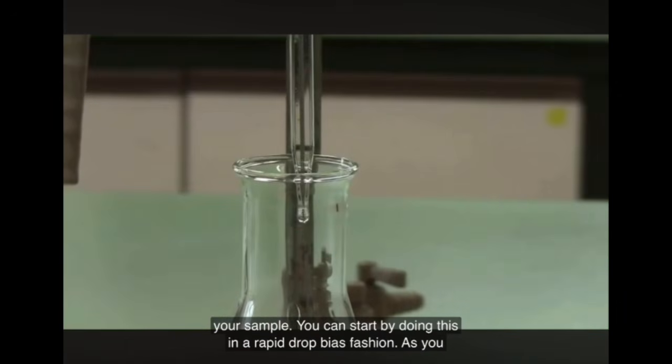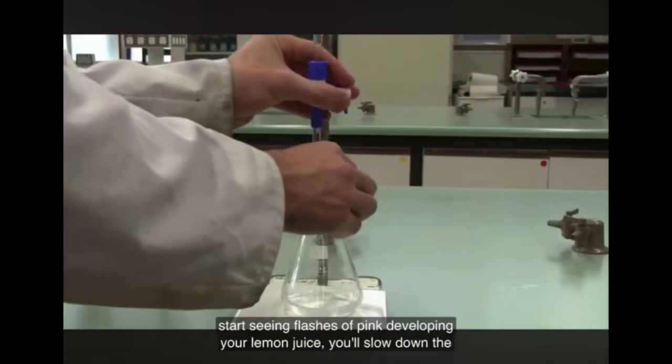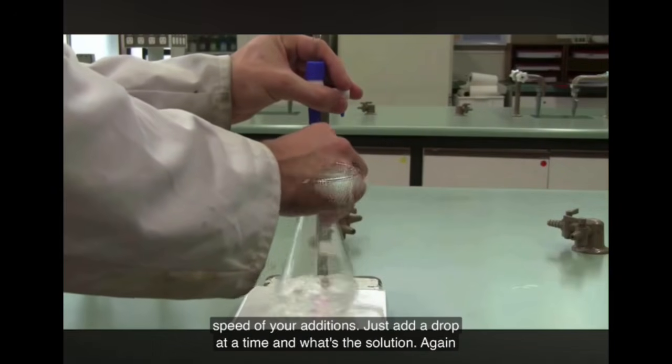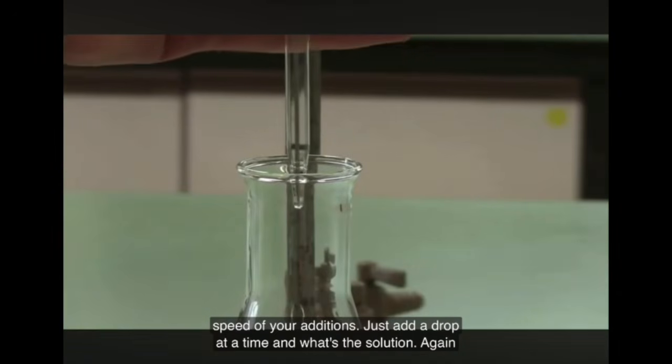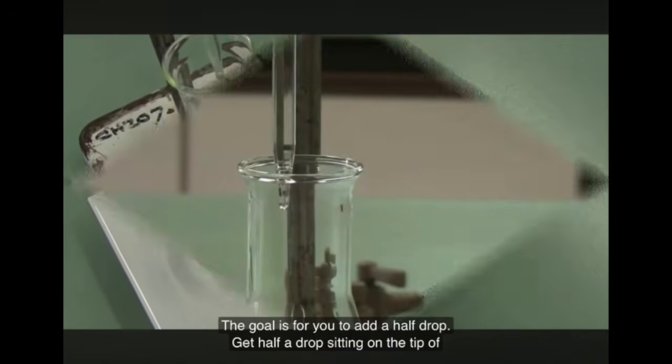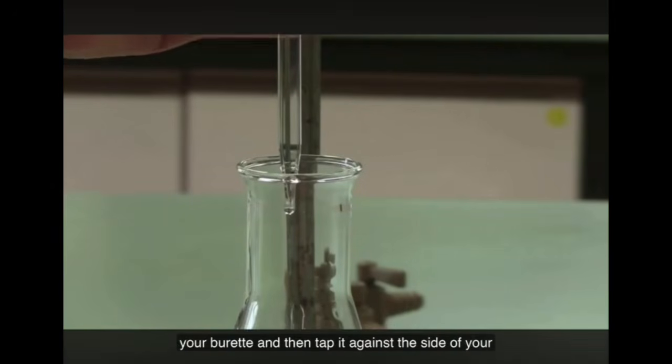You can start by doing this in a rapid dropwise fashion. As you start seeing flashes of pink develop in your lemon juice, you'll slow down the speed of your additions. Just add a drop at a time and watch the solution. Again, those flashes of pink will get brighter and brighter as you get close to the end. The goal is for you to add a half drop. Get half a drop sitting on the tip of your burette.